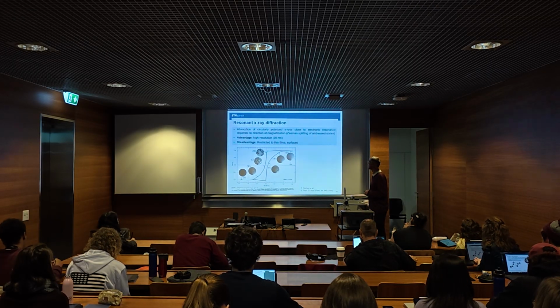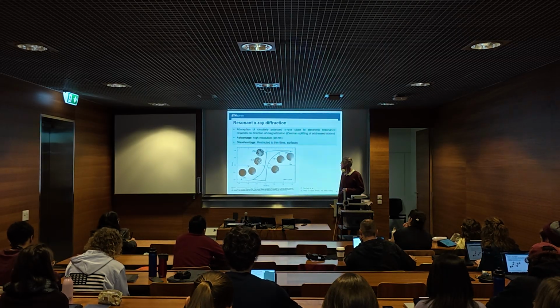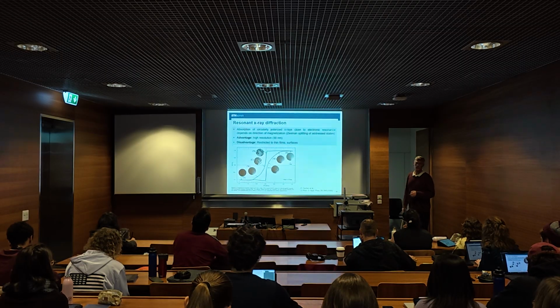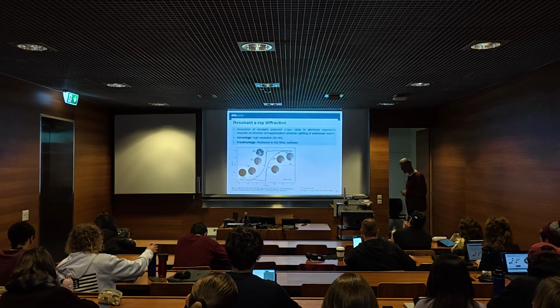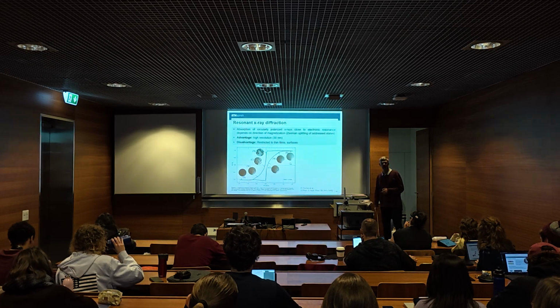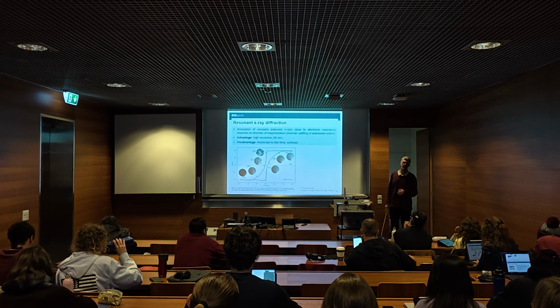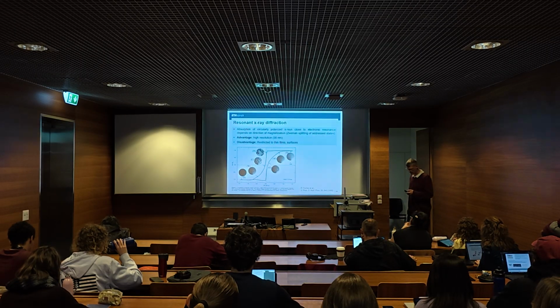The advantage is that X-rays have a very high resolution. 30 nanometers is pretty good. The disadvantage is it only sees a very thin layer of material or a thin film. And surfaces are sometimes different from the bulk. They're easily polluted, and then this technique is therefore quite sensitive to the environmental conditions.